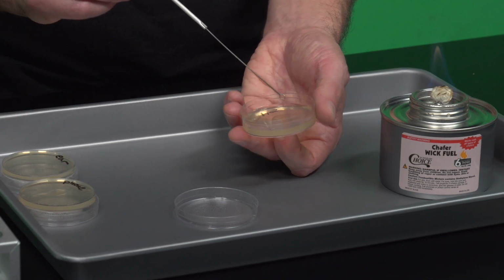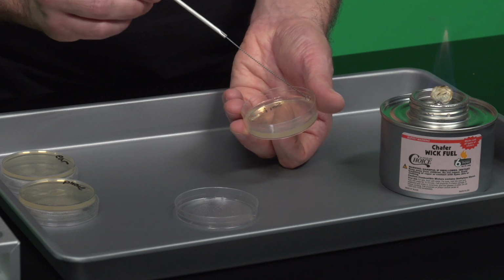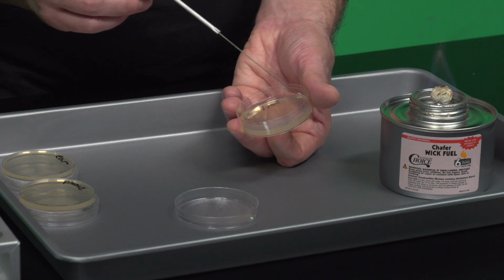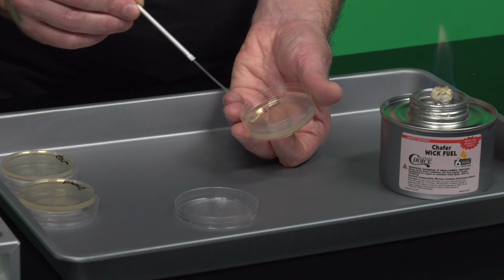Okay, so now I'm looking at my plate. I'm going to start in quadrant, move over, and then essentially just keep doing the same thing.